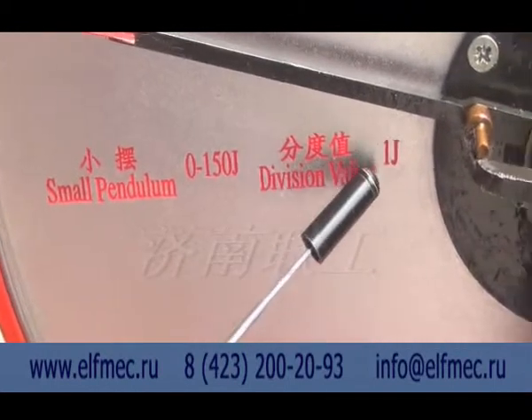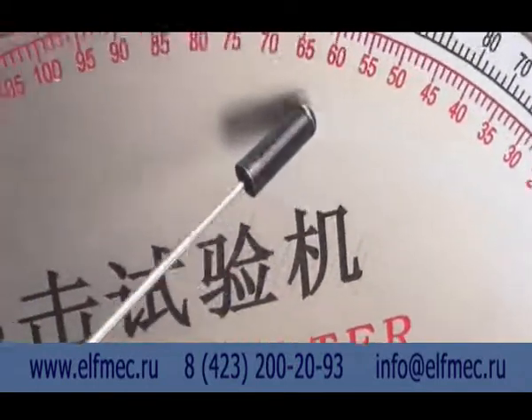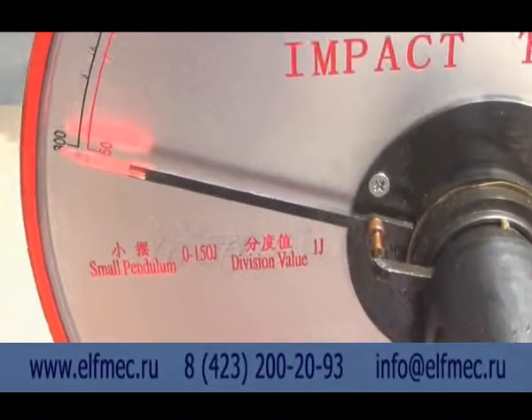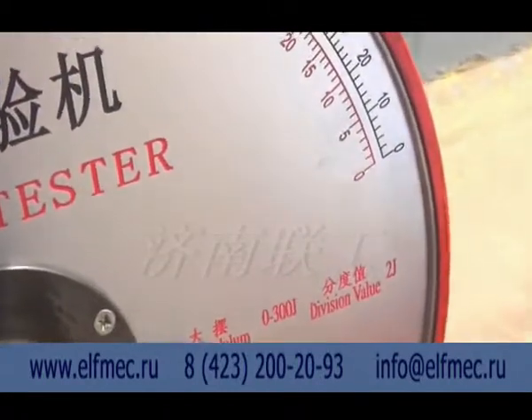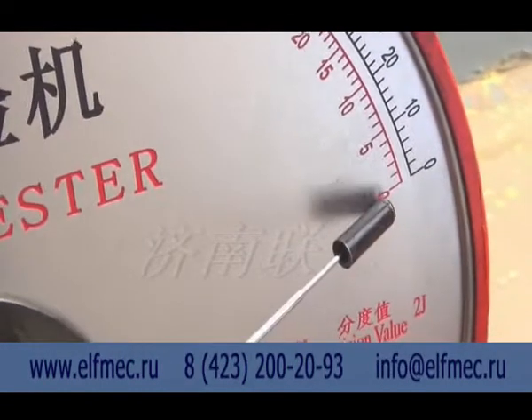Dial reading mode of a small pendulum. On the dial you can see the scale dividing range of the small pendulum. Read the energy value from the red line within the scale line. The energy value is read from right to left. The pointer indicates that the energy value rotates from left to right.